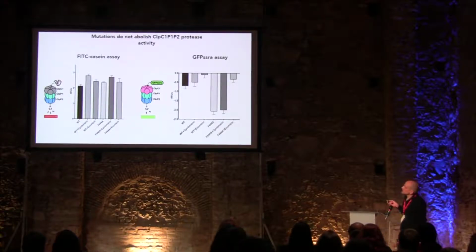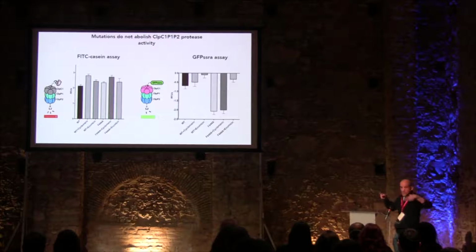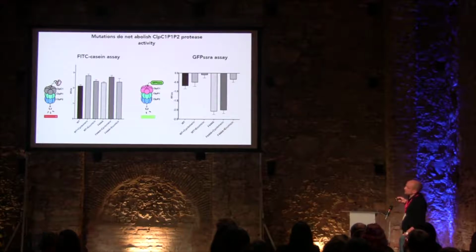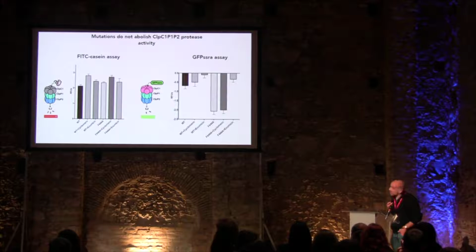And it's used in these assays because it can be modified with fluorescein. So what we do here, you have a protein labeled with a fluorescent tag. As the protein is degraded, you have an increase in fluorescence. So what happens basically here, you mix everything, you make your chaperone, your unfoldase or chaperone, as you want to call it, and you mix the protease, and then as the protein is degraded, you have an increase in fluorescence. What you show here is that yes, this mutant was still active, still working fine.